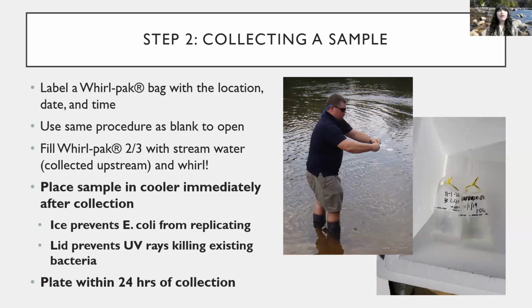So remember how we said that the temperature is a really important factor with bacteria. The cooler temperatures help preserve the sample and prevent the breeding. The higher temperatures breed bacteria. So it's important that you have ice in your cooler. You also want to make sure it has a lid, because exposure to the UV rays will kill any of the existing bacteria in your sample. And then you'll just want to make sure that you plate these samples within 24 hours of when you collected them.